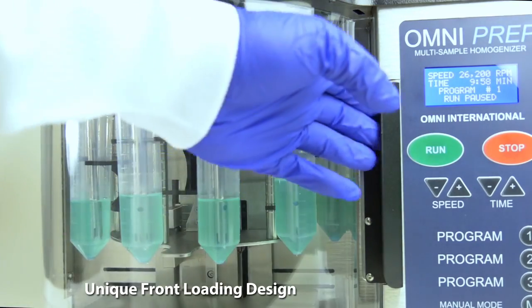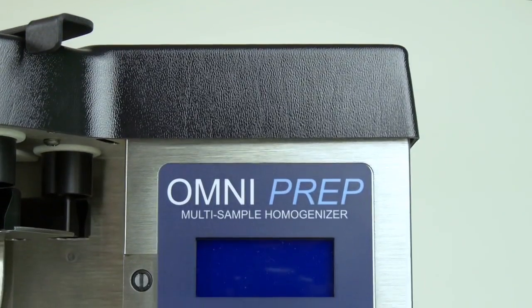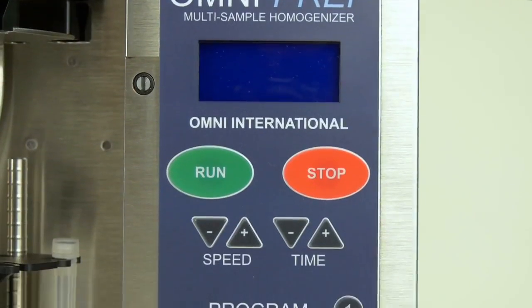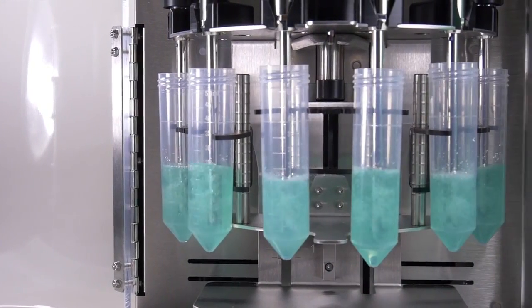The unique front-loading design and easy-to-use controls of the OmniPrep 6 greatly simplifies the process of sample homogenization.